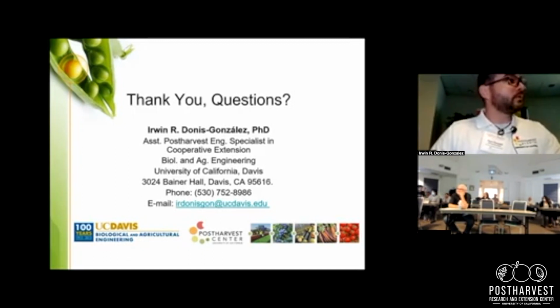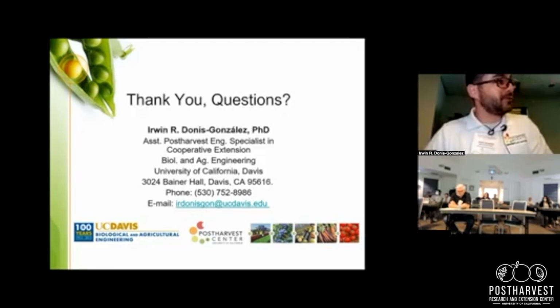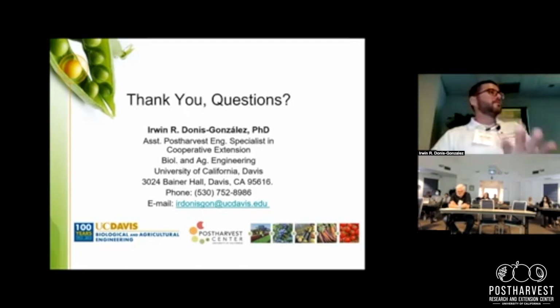It's an important attribute, yes, very important, but I was focusing specifically on what we could do with optical measurements. Firmness is typically a measurement of elasticity. Unfortunately, we could potentially measure bulk density with density measurements, but it doesn't relate to elasticity. So there are alternative methods, and we can talk about a whole other section, by the way, of how to measure firmness.